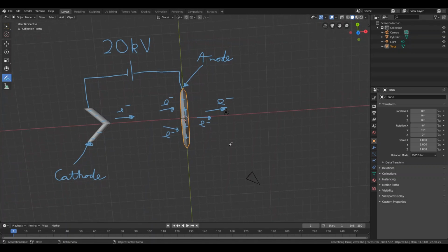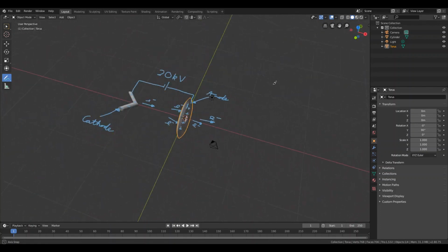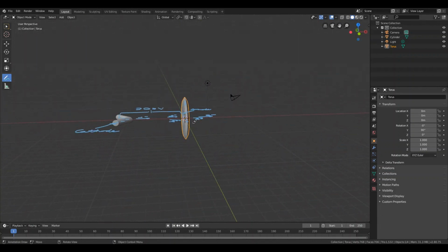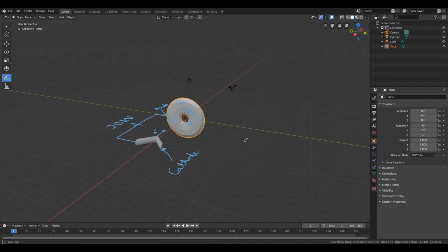All this effort was to make these, so that they could fly away at incredibly high speeds. Actually, very fast, just pyong. So further down the line, you will have not one lens, but several lenses, and then you will make a scanning grid on a small object, and then register the results of that later.